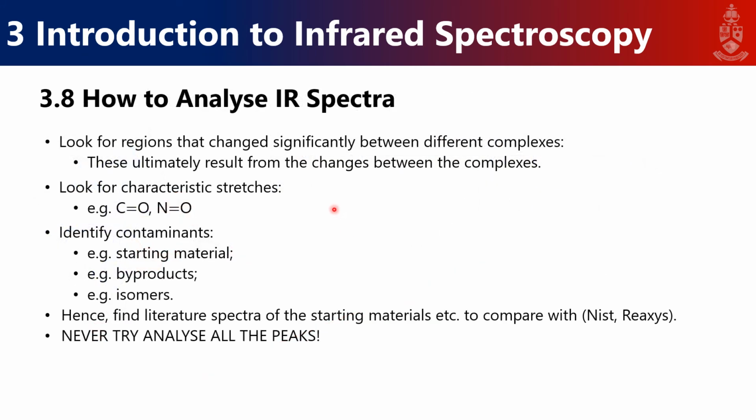And what I've tried to show you with these theoretical spectra is exactly how you would typically use IR. You would look at different spectra of different molecules, or use things like your starting materials and ask, do your starting material and your product's IR spectra differ significantly?